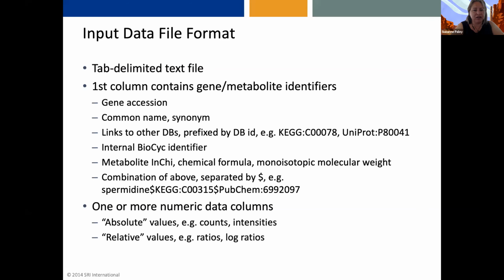And those can take any one of different forms. For example, it can be the gene accession. It can be a common name or synonym. Anything that we have on one of our pages as listed as a name, we will accept that. Hopefully, unambiguous ones are better.